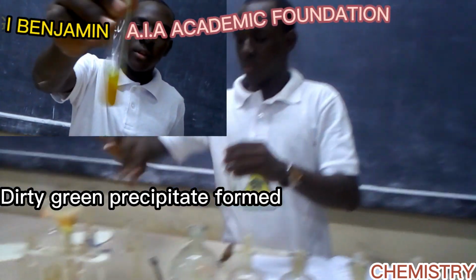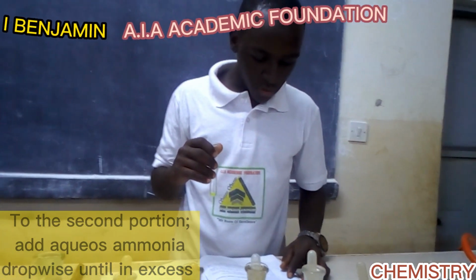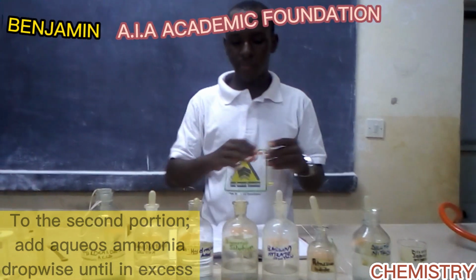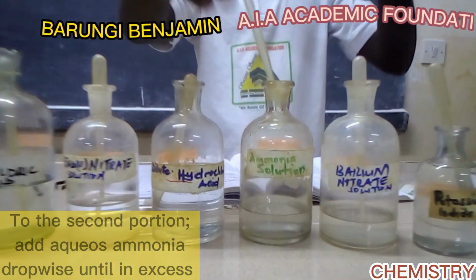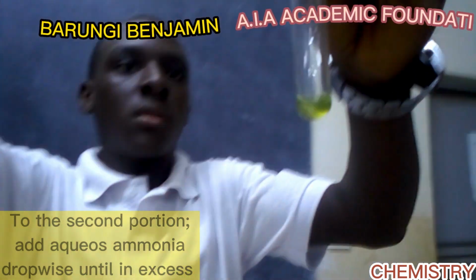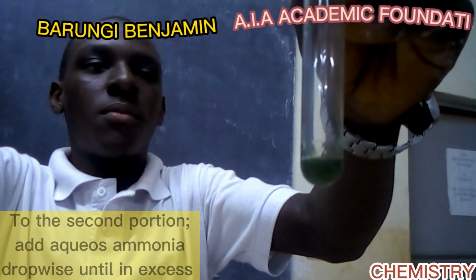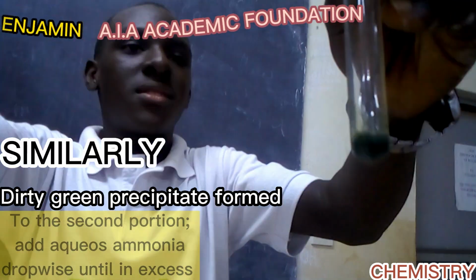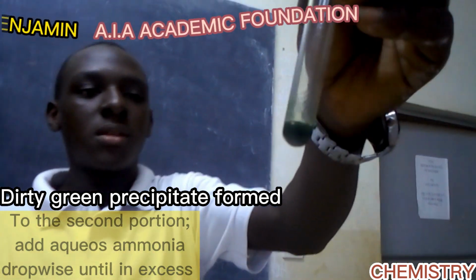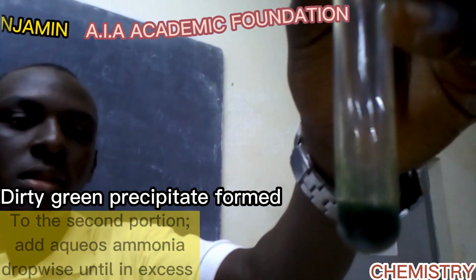And now they have told us, to the second portion, add aqueous ammonia. So this is our aqueous ammonia. So until in excess, dropwise. As you can see, it's also forming a darker green precipitate. You can see it. This confirms that we have iron 2 ions present in our solution.